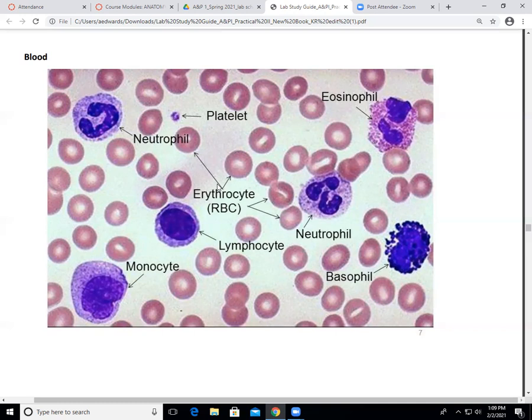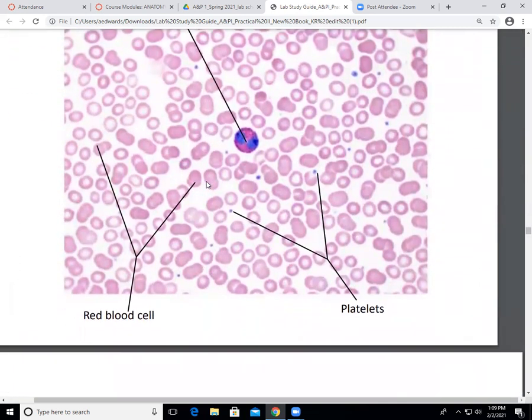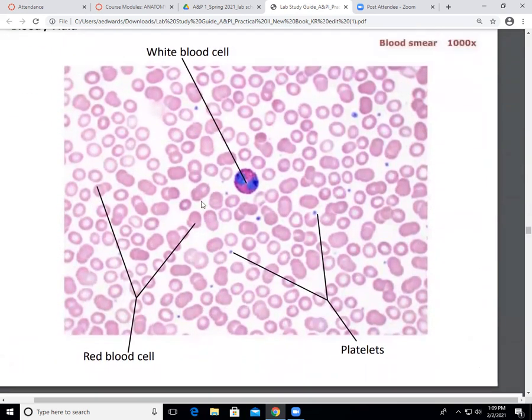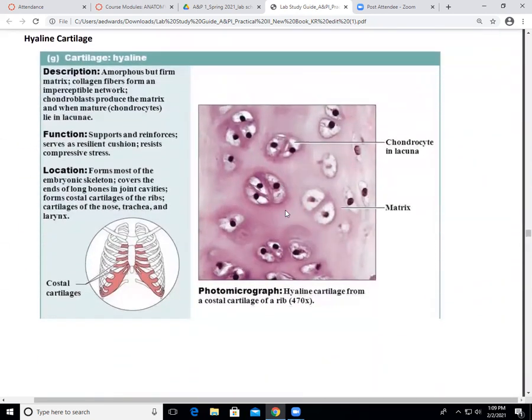Okay, because y'all can do the rest of that identification in AMP2. Okay. All right, another view again, red blood cells, white blood cells, and platelets. Reds, red blood cell, purples, white blood cell, dots are platelets. Okay. All right, and we're not really going to cover lymph in this class, but again, that's for AMP2. Just know that it is a fluid connective tissue.